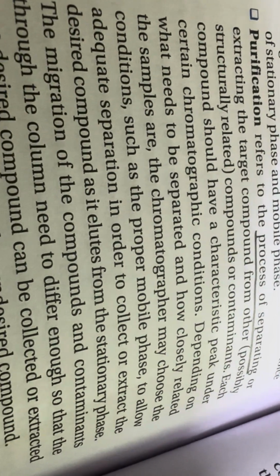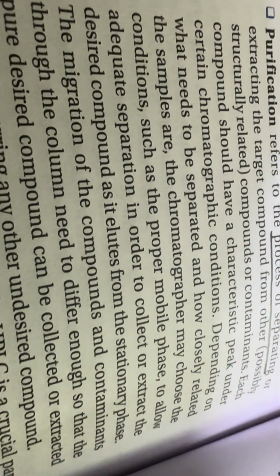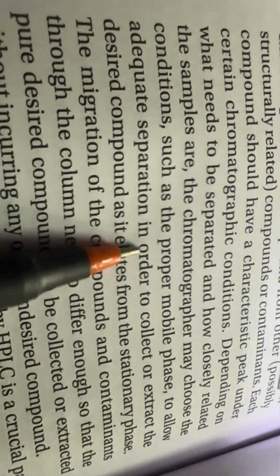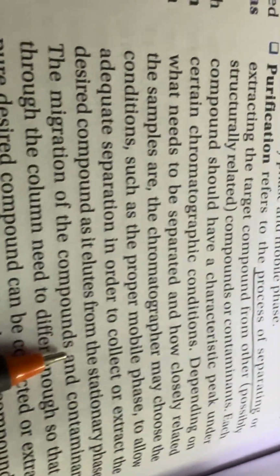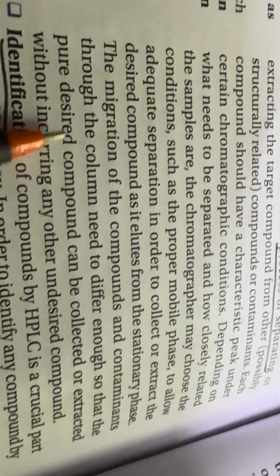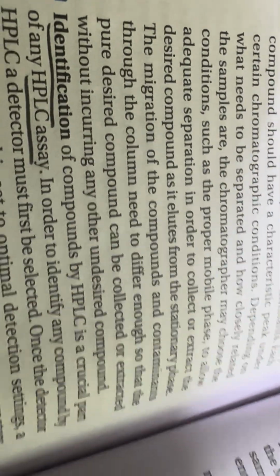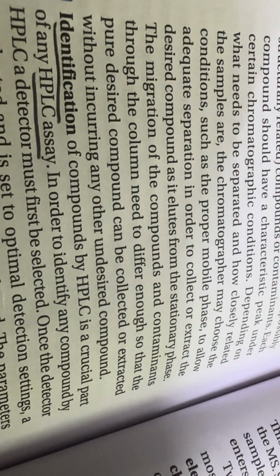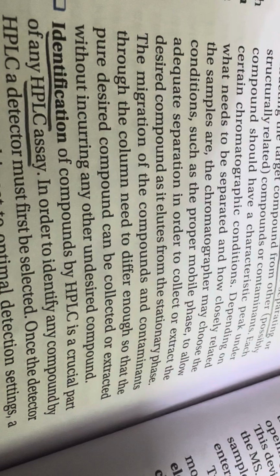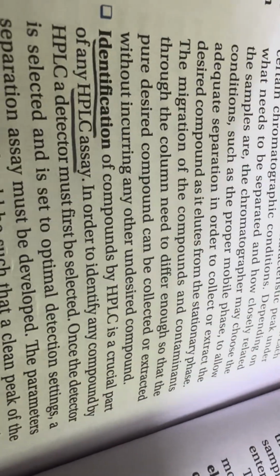The chromatographer may choose conditions such as the proper mobile phase to allow adequate separation in order to collect and extract the desired compound as it elutes from the stationary phase. The migration of the compounds and contaminants through the column needs to differ enough so that the pure desired compound can be collected or extracted without incurring any other undesired compound.